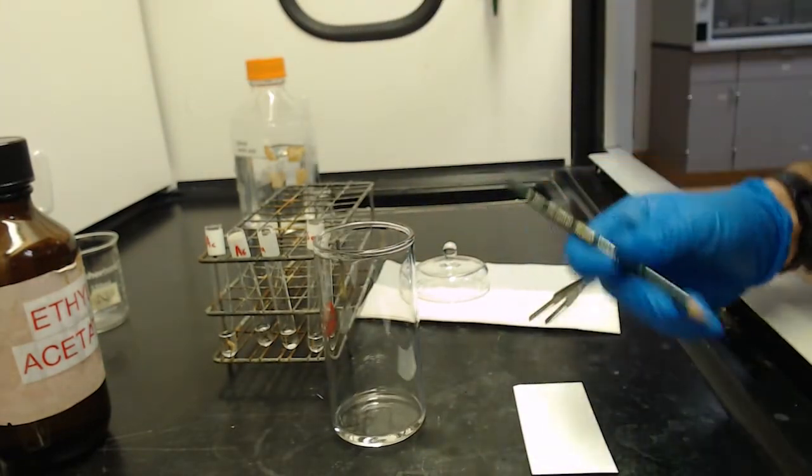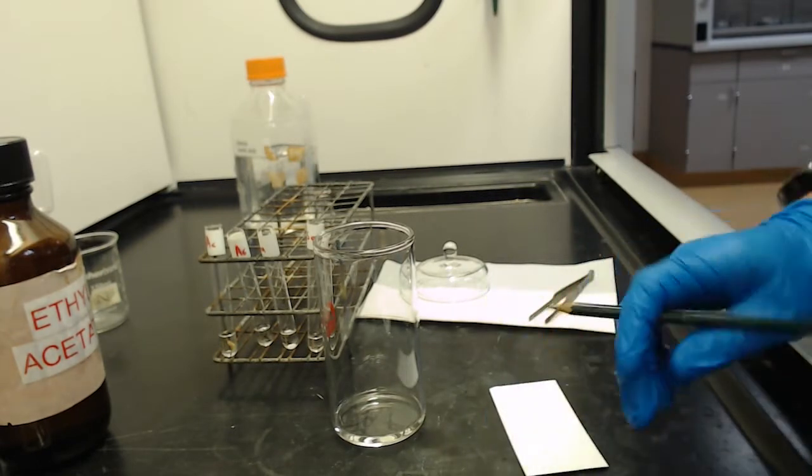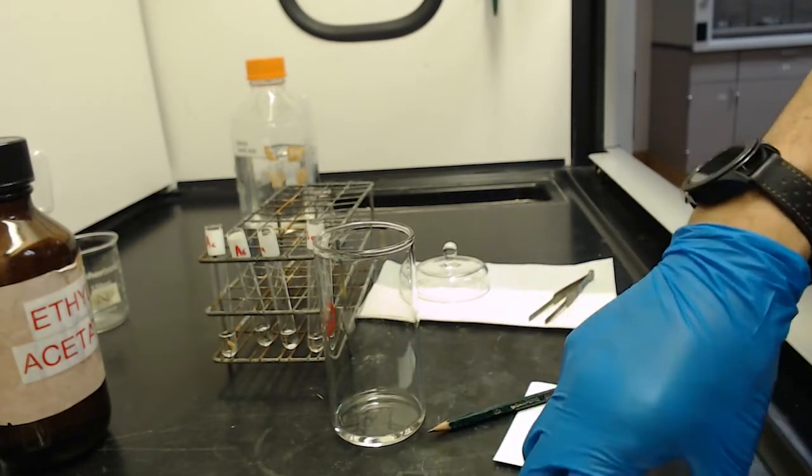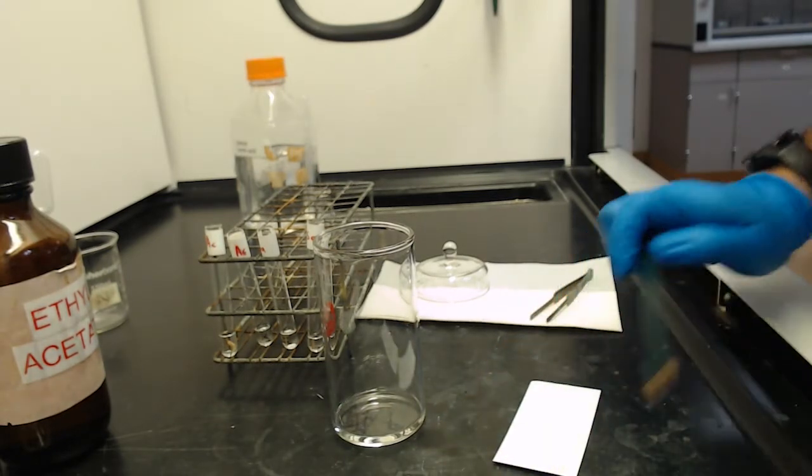So looks like we went up there. So I just did a fine little pencil mark about where it went, and we will develop that here in a few minutes.